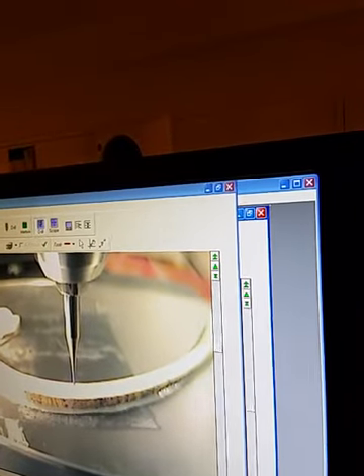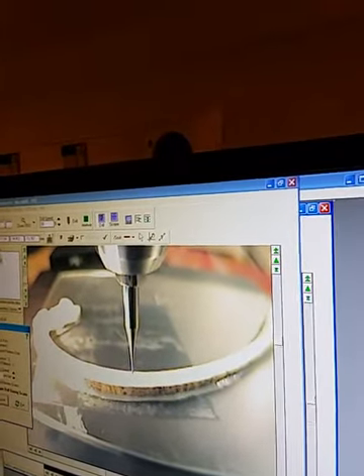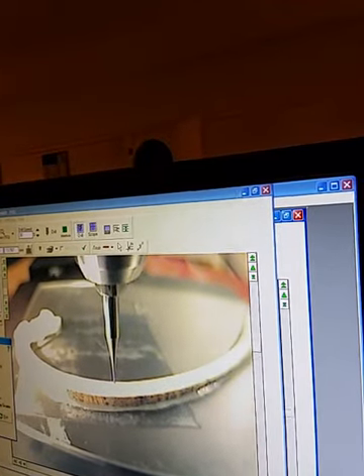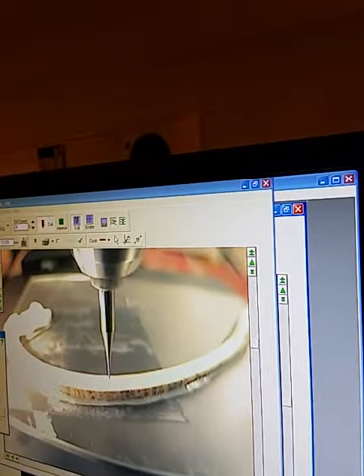And again, you got to make sure, you see I've got that other one way over here. So if I select all patterns, it's going to go do that one first. So I got to make sure I select only that one. 200, enable the drill, run. And run. And watch closely to make sure it does what you want it to do.